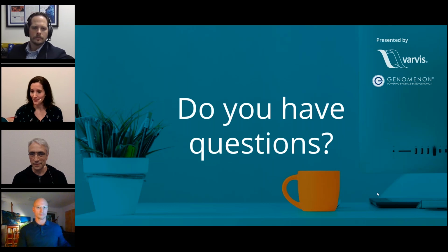Okay, last question. I think we're running out of time. How do you implement the latest suggestions for variant classification? Especially I ask regarding the recommendation to downgrade PM2 to PM2 supporting. Who wants to take this question? It's not stated to whom this question is. Ben, do you want to comment on that?